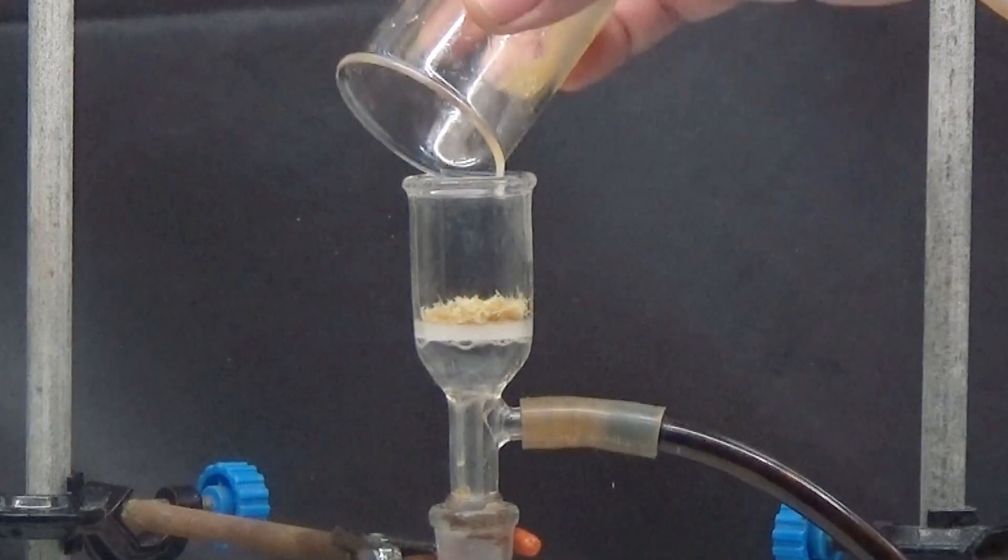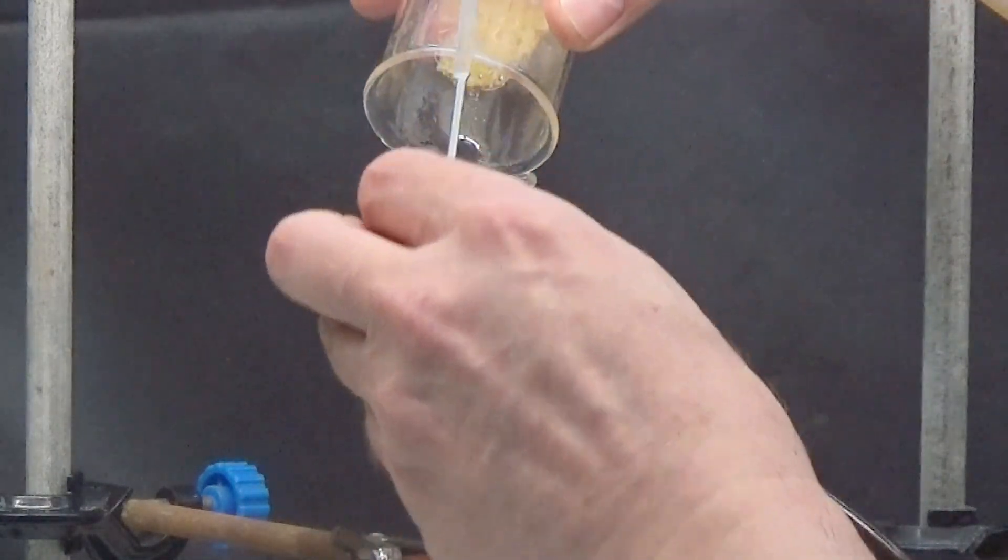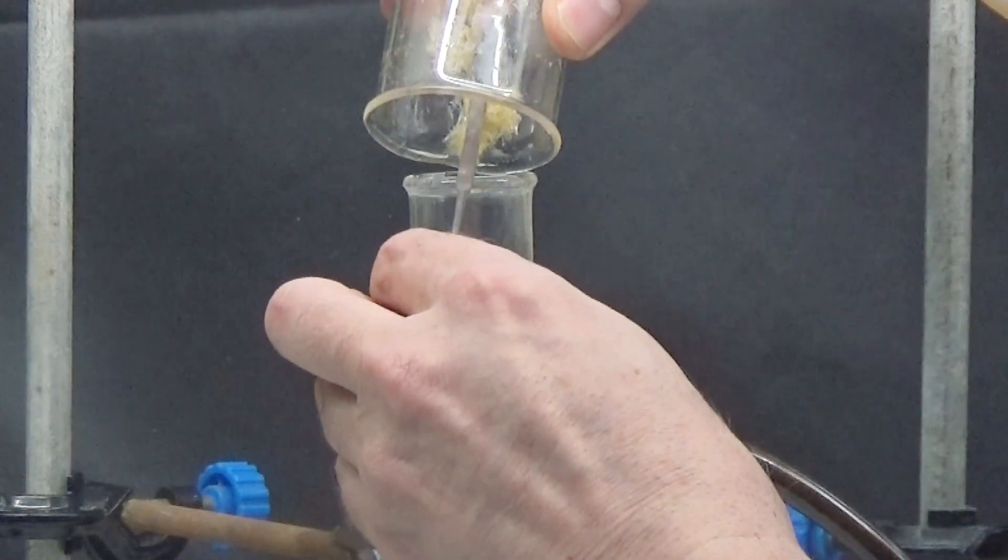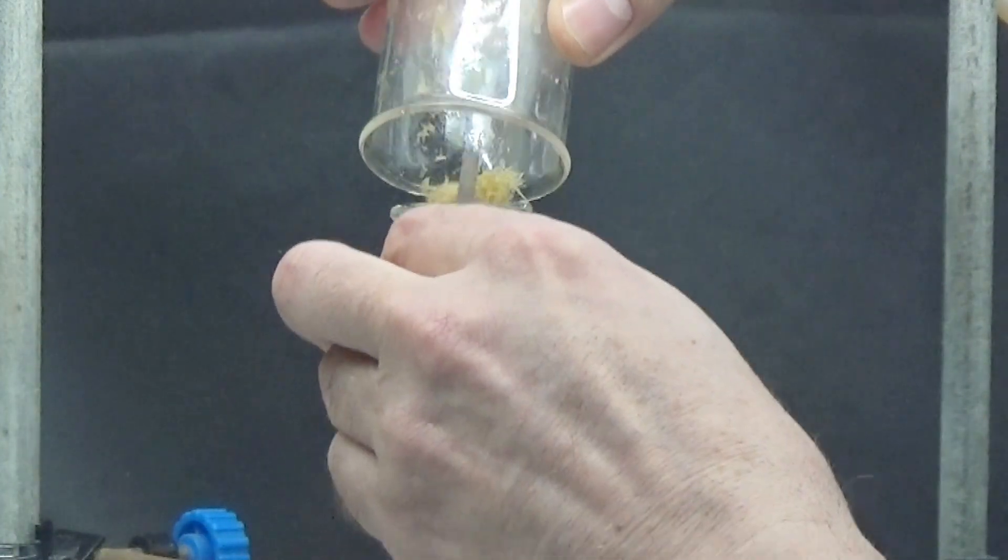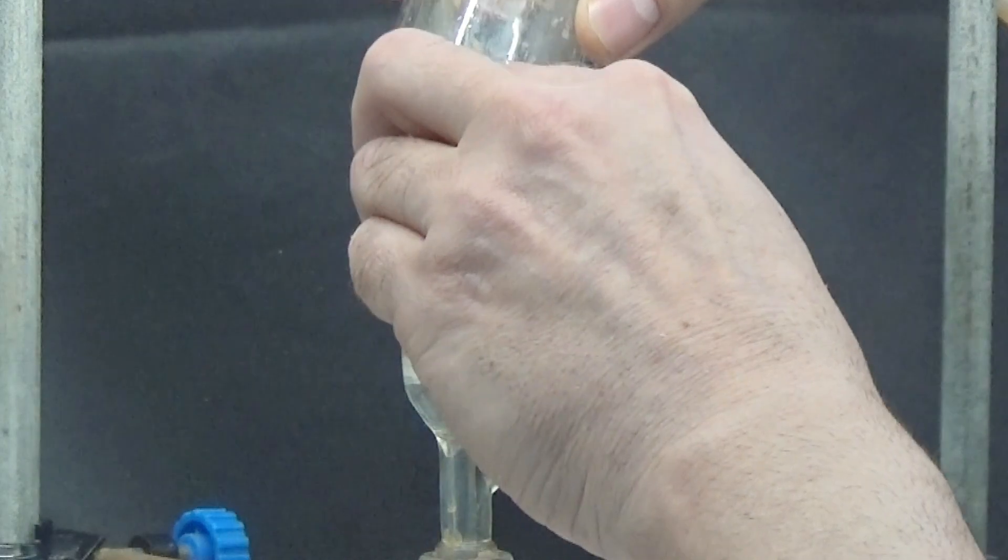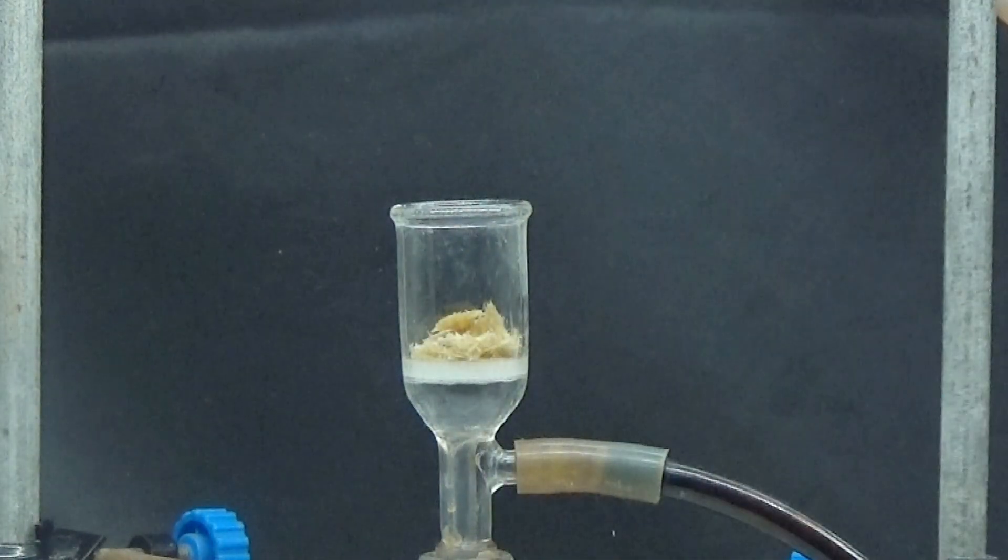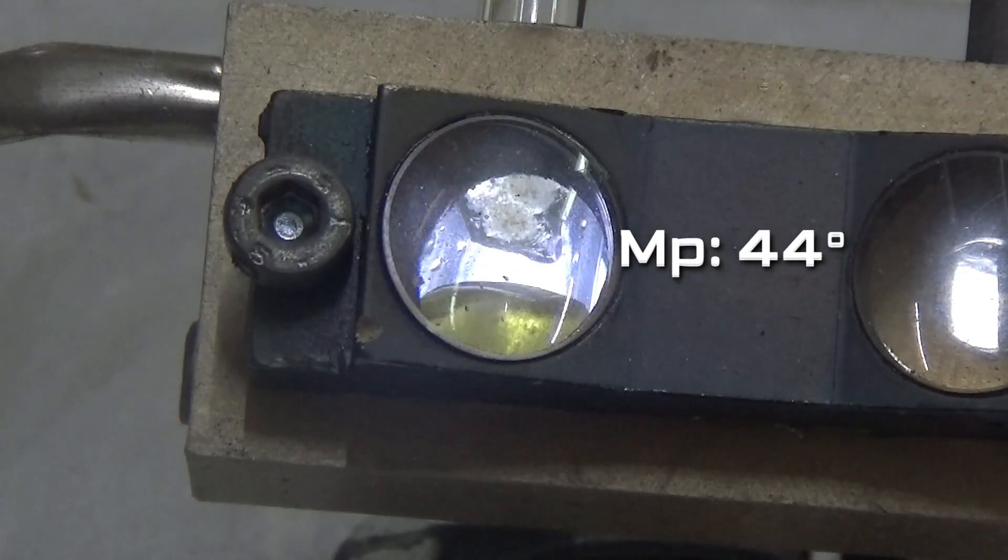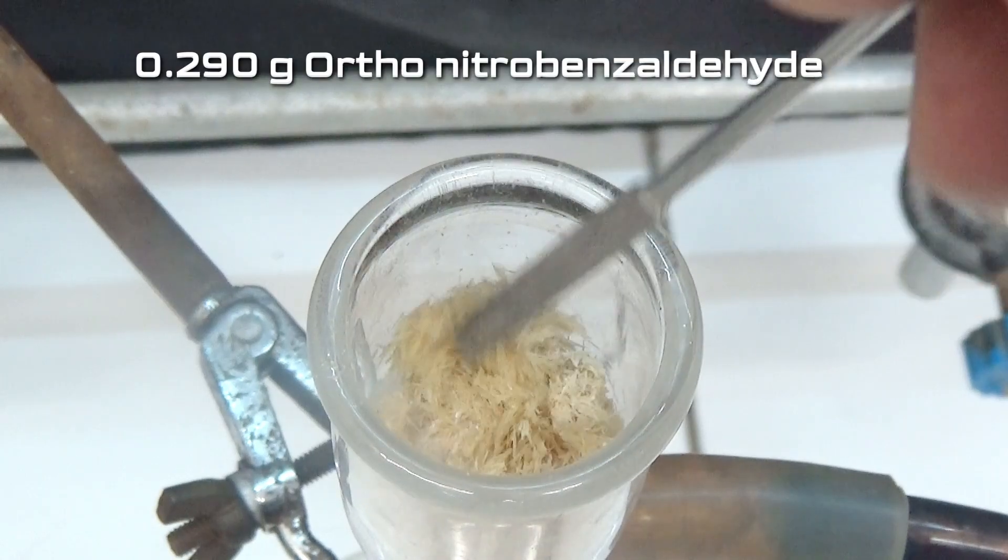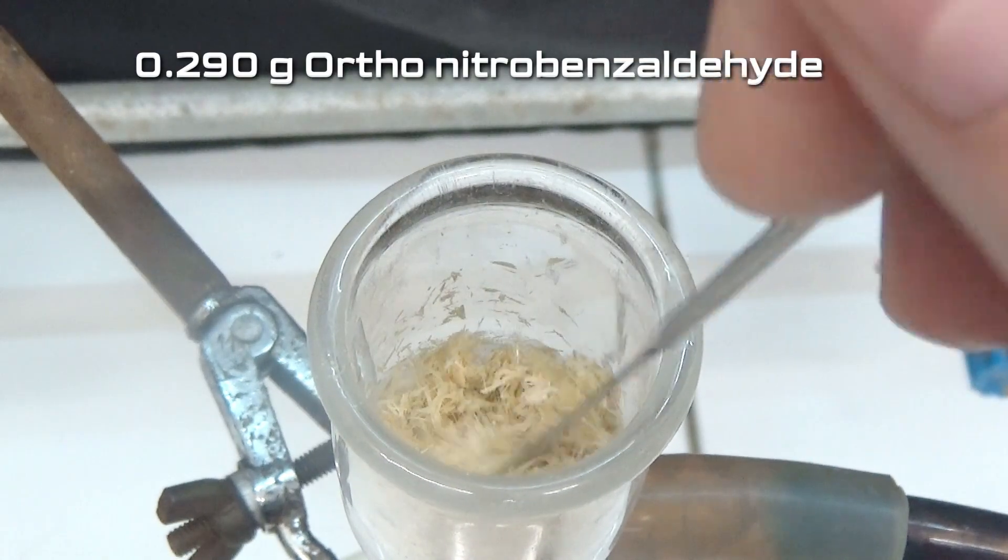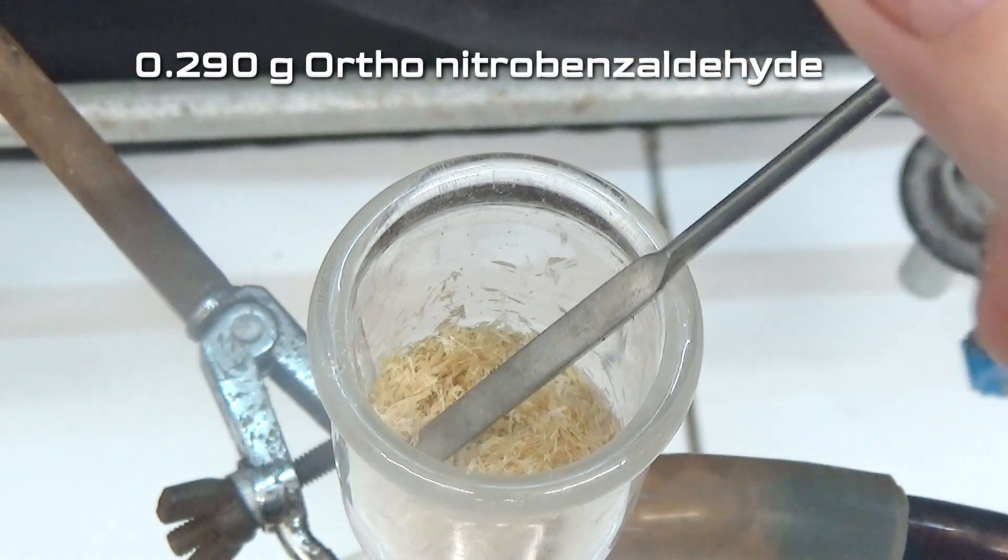Yellow needle shaped crystals were obtained and collected by suction. Wash with a little cold hexane. The product has to melt at 44 degrees. In this operation 0.290g of ortho-nitrobenzaldehyde have been obtained.